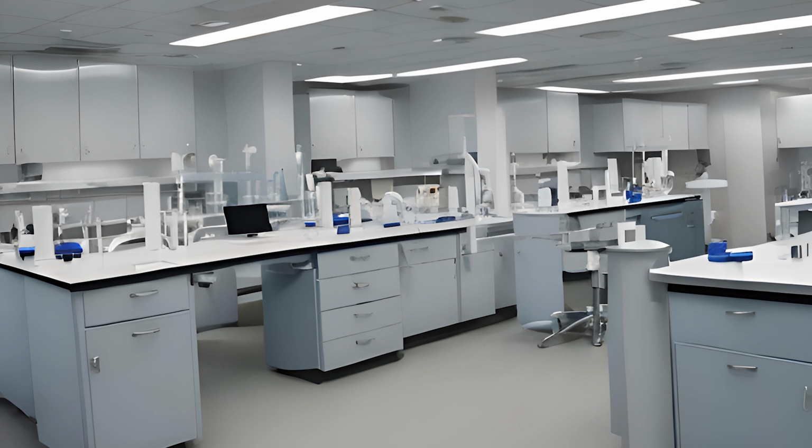Your lab is required to have a chemical hygiene plan, a CHP. Major elements of this will include a listing of the responsibilities for the employer, the facility you work at, and for the employees who work there. It's going to include safety data sheets for every hazardous chemical stored or used in your lab. These used to be called MSDSs, Material Safety Data Sheets. If you see that term used, that means you have outdated references. They are now called SDSs.